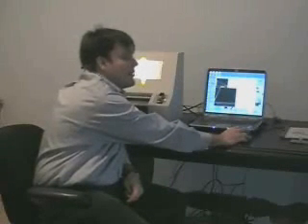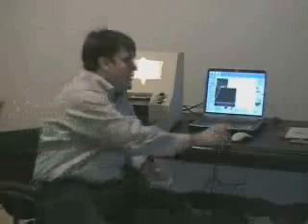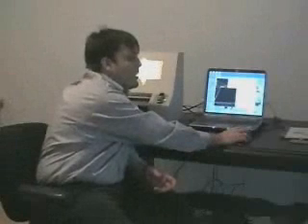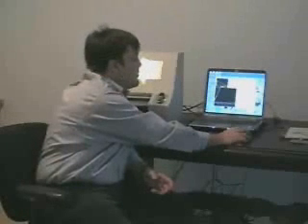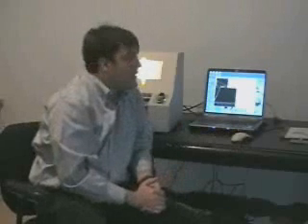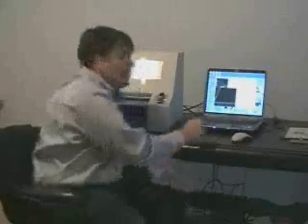Simply check on Calibration Mode, and again, nothing will happen. But what should happen is all the lights on the machine and the motor should turn on. As I said, the COM port has not been specified correctly. Therefore, uncheck Calibration Mode, and right below that you'll see something that says Control COM port. The default is 1. Change that to a 2, and then click again on Calibration Mode.